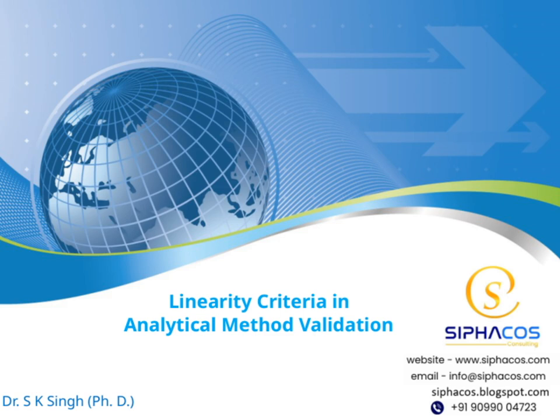Today, we'll be exploring the important topic of linearity criteria in analytical method validation. Over the course of this session, we'll discuss what linearity means in analytical methods, why it's crucial for validation, and how we can effectively evaluate it. I'm excited to guide you through this essential aspect of quality assurance in analytical chemistry.